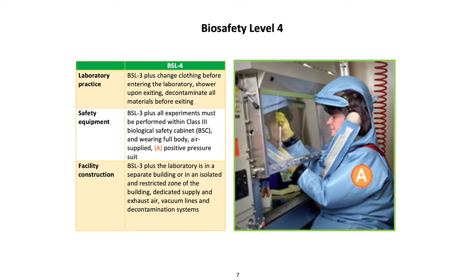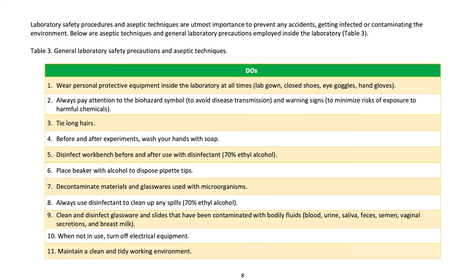BSL 4 laboratory practice: BSL 3 plus change clothing before entering the laboratory and shower upon exiting; decontaminate all materials before exiting. Safety equipment: BSL 3 plus all experiments must be performed within a class three biological safety cabinet while wearing a full-body air-supplied positive pressure suit. Facility construction: BSL 3 plus the laboratory is in a separate building or in an isolated and restricted zone; dedicated supply and exhaust air, vacuum lines, and decontamination systems.